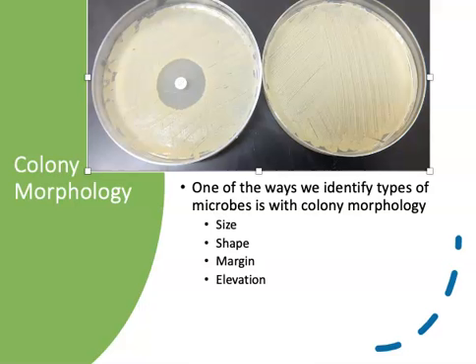Typically, when we talk about colony morphology, we're talking about size and shape. We're talking about elevation, how far up above the surface of the agar the colony grows, and also about something called the margin or the edge of the colony, because that can take on different forms.